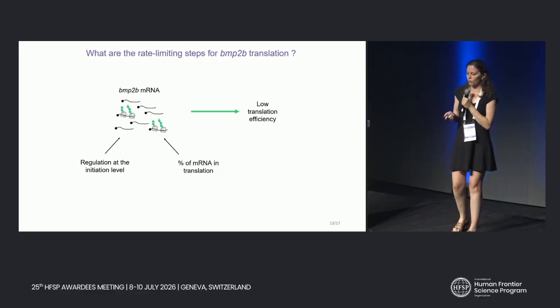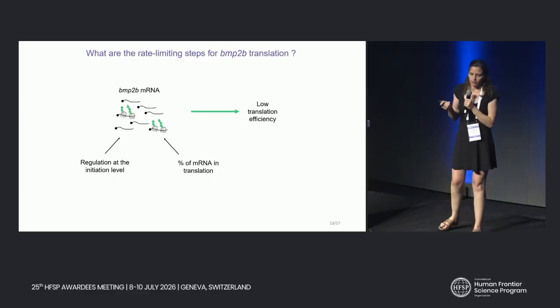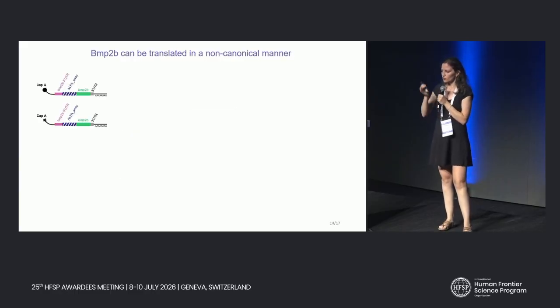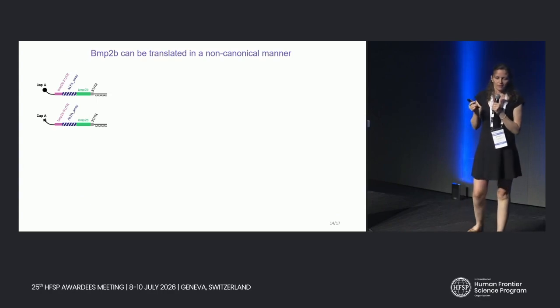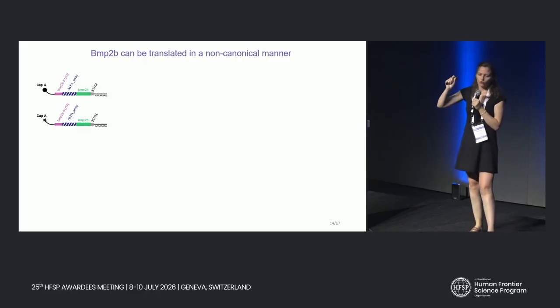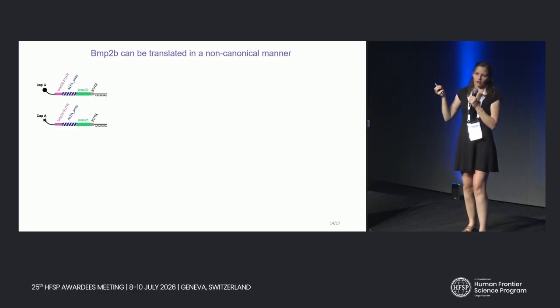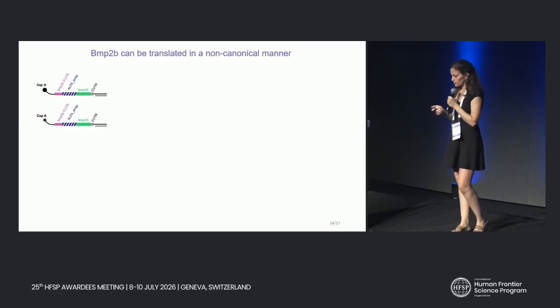And so we also tested another feature of the mRNA that could influence translation. I'm going to show you just one example here, and cut the long story short: basically, we tested the capping of the mRNAs. The mRNAs are normally capped with a guanine, and then we replaced this cap with a cap analog that is non-functional, so it cannot be recognized by the translation factors.